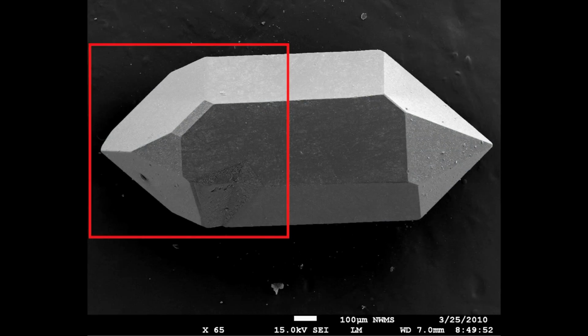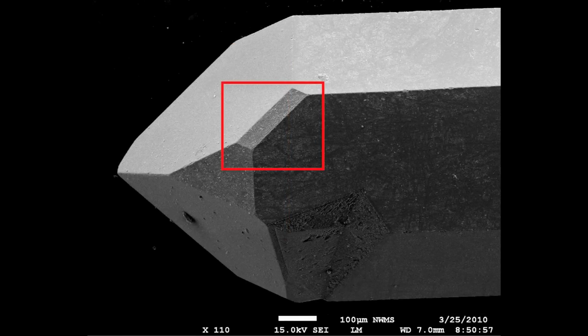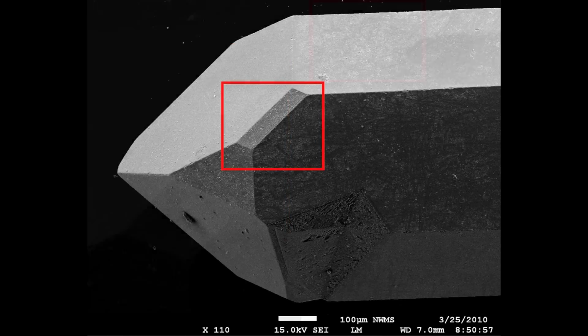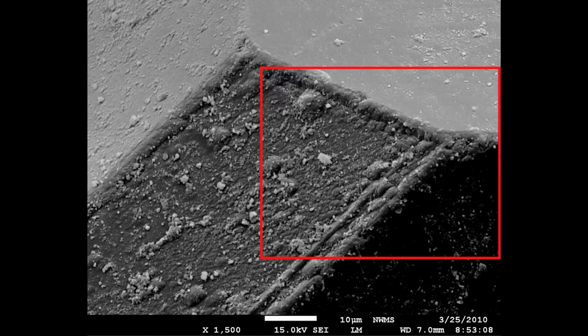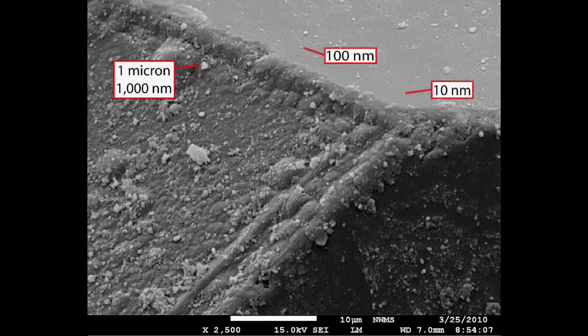Now, here are several images of a quartz crystal where we're going from low to high magnification. You can see increasingly smaller and smaller objects on this. In the nanosciences, you're going to be looking at objects that are usually less than 100 nanometers. And you can just barely start to see those size particles on the last image of the quartz crystals. So you can see that you're working with extremely small particles.